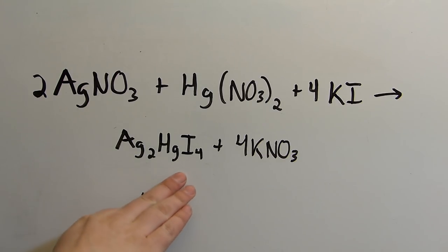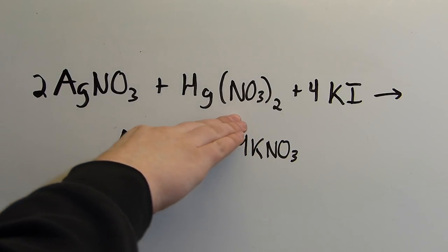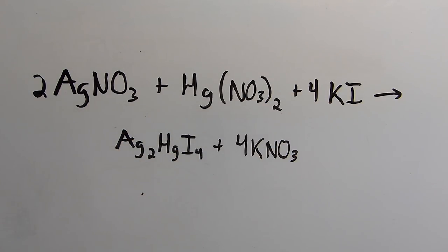To form the tetraiodomercurate compound I simply need to mix together a soluble salt of silver with a soluble salt of mercury and a soluble iodide. In this case we'll be using potassium iodide and the nitrates of both silver and mercury since all of these are very soluble in water. When combined they form this tetraiodomercurate compound which is insoluble and precipitates, leaving potassium nitrate behind in the solution which can then be filtered.